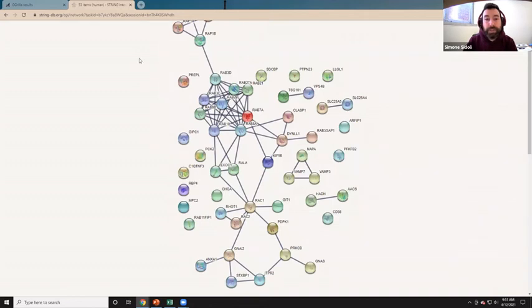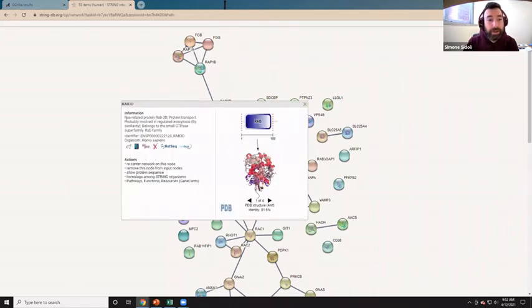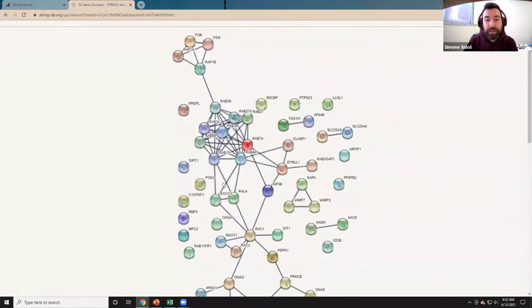And then without knowing anything about any of these proteins, you immediately notice that there is a group of proteins, all called RAB something, that are all clustered to each other, which means that in your data set there are several proteins that belong to the same family, that they seem to be all enriched in your R&D treatment. So these proteins, they actually are RAS-related proteins. They are responsible for forming vesicles for exocytosis. So it makes a lot of sense that you found an enrichment in secretion. So that could be an interesting follow-up.